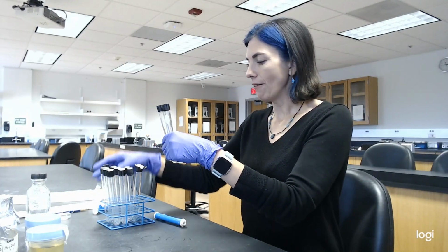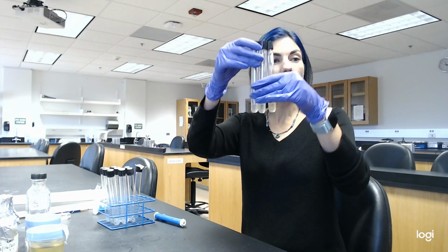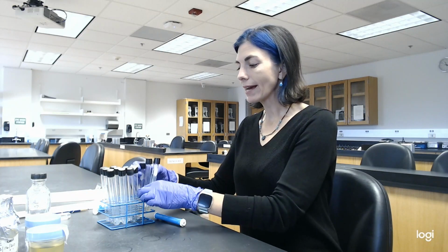So now we have our urine samples mixed and our nutrient broth mixed with E. coli. My next step is going to be to do serial dilutions. What I want to do is a set of serial dilutions of these samples right now, and that will give me a count or a concentration of E. coli in each of these samples. Then I'm going to put all 3 of the test tubes in a water bath for 2 hours, and then we're going to see how the samples compare 2 hours later.